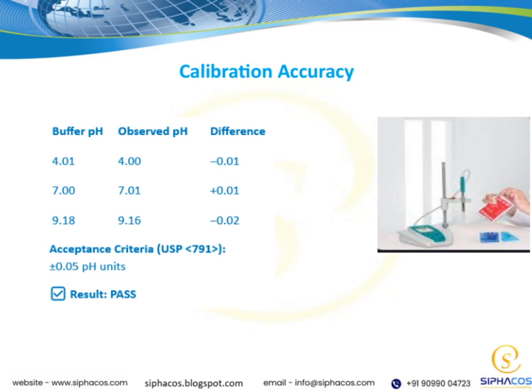High calibration accuracy means we can trust the data we're collecting, which is vital for making informed decisions and maintaining quality control. Throughout this presentation, we've emphasized the importance of precision and consistency, and calibration accuracy ties directly into that. If our calibration isn't accurate, even the best sensors can lead us astray, affecting the overall performance of our system.